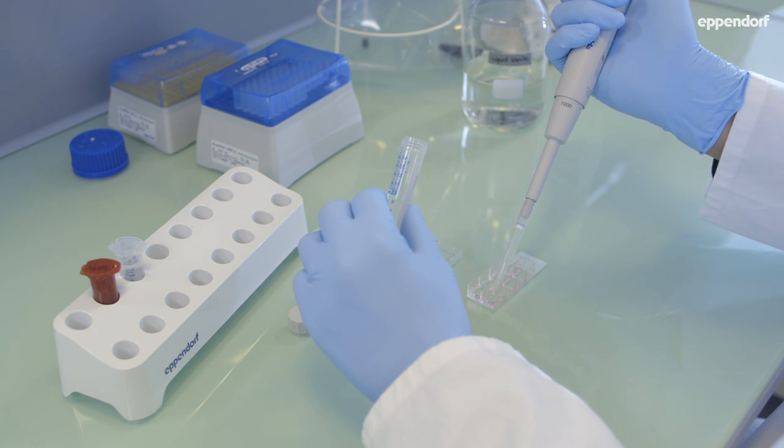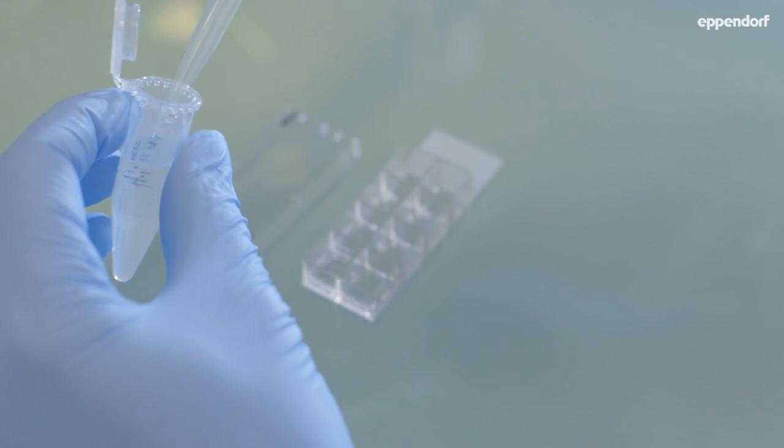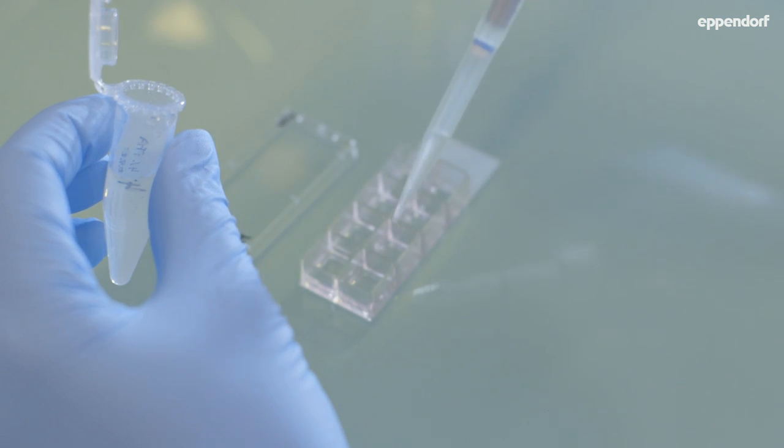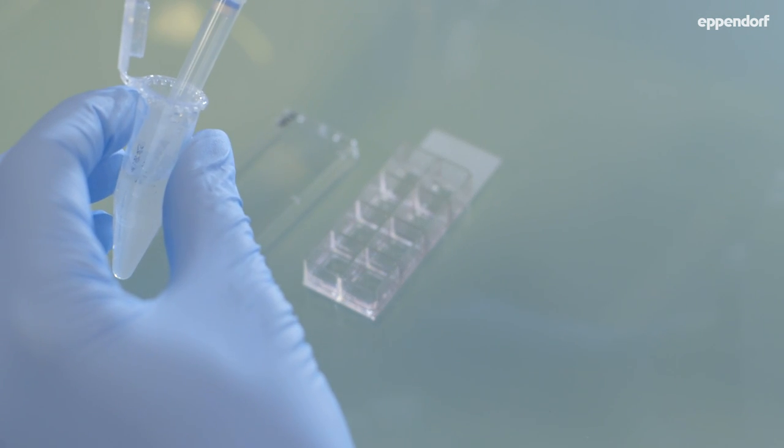Follow supplier recommendations and optimize your staining protocol to keep the concentration of fluorescent probes as low as possible to reduce staining artifacts.